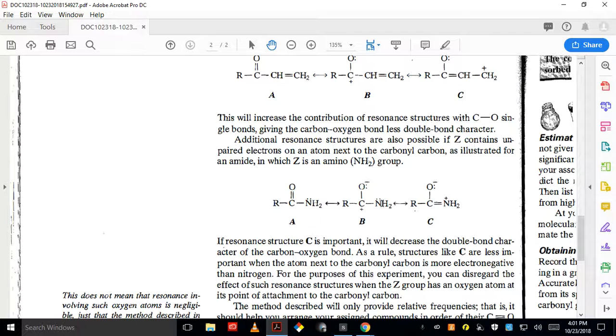What else would we be looking for? Aldehydes, for example, wouldn't have much of an effect because there's just an H there. It wouldn't take away, it wouldn't add to it. So if we looked at a list of things that would be good, just your carbon chains would probably be the best. Aldehydes would have little to no effect, more than likely.